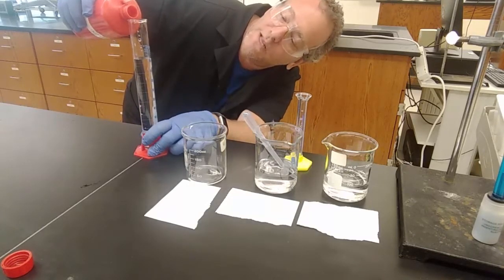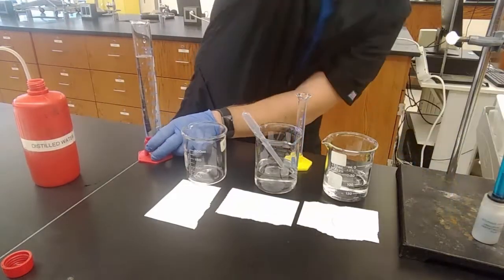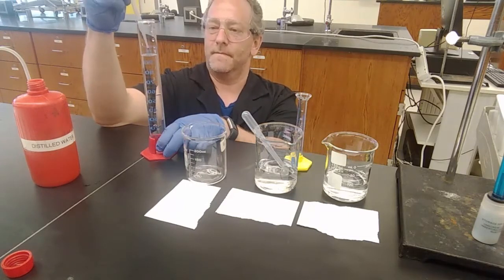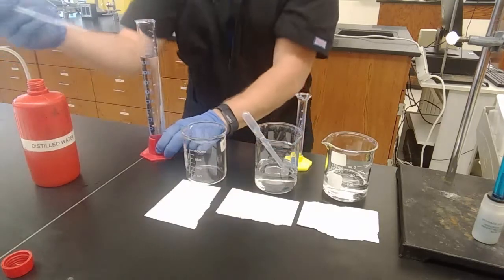This I've got to do really carefully. Might need a pipette for this one. I had exactly 100. I need exactly 99. Exactly 99.